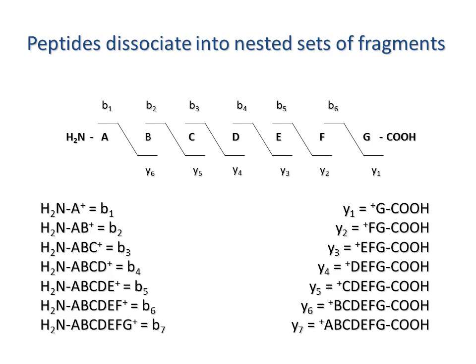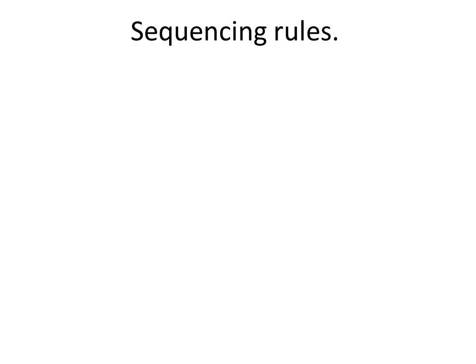So we end up with a series of fragments that will hopefully reflect the entire amino acid sequence of the peptide. This will ultimately depend on the amount of peptide present and the sequence, as certain amino acids can cause preferential fragmentation through a particular bond, and certain ions will be more intense, which explains why the peaks in our spectra are all different heights. There are some general rules that we can follow when trying to sequence a peptide from an MSMS spectra.